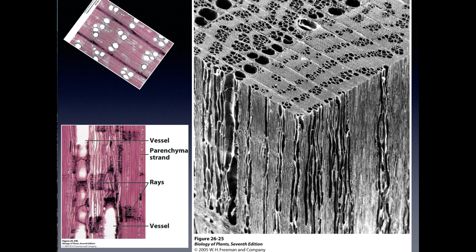And what I've done here is I've aligned this picture so that it goes with the angle that we're seeing here, because this right here is a two-dimensional version of the top of this three-dimensional cube of wood. And so these lines right here, those correspond with this line right here and this line right here, because we've got those larger early wood vessels right by those lines in both of these yearly growth increments. And then when we look at the side view, this is a two-dimensional version of the side view of, say, something like right here-ish.